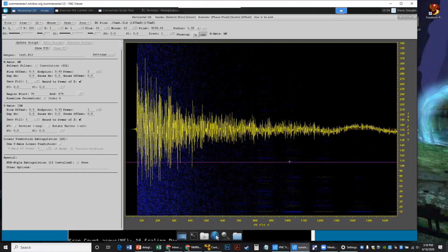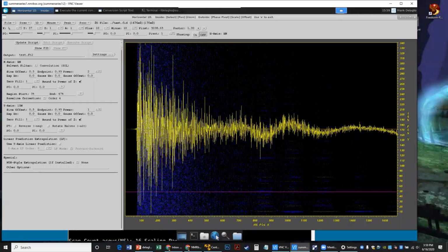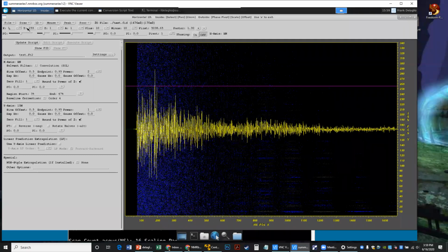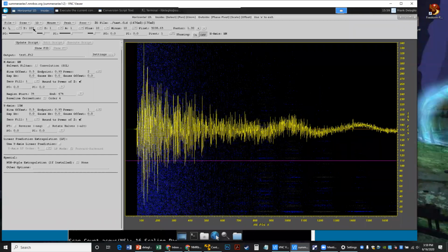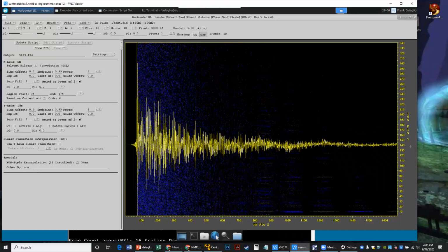And you might also notice as I change which vector I'm viewing by dragging the mouse cursor, if you look at the command panel up at the top left, you'll see that the slice number in the indirect dimension, the y-axis, is being updated in real time as I drag the cursor. And if I want to, I can point with the mouse to this text entry area and actually type in a specific number, like 1. So here's the first 1D slice of the data. Here's what it looks like.